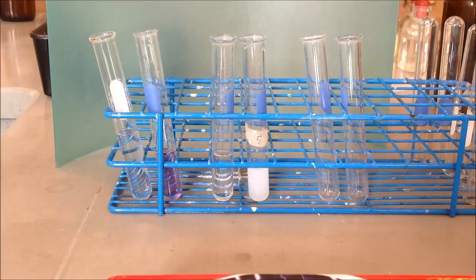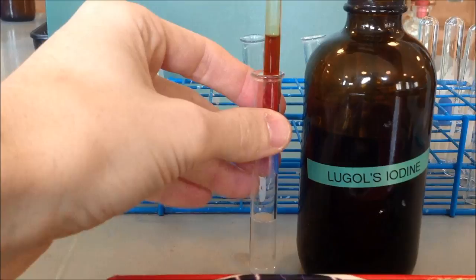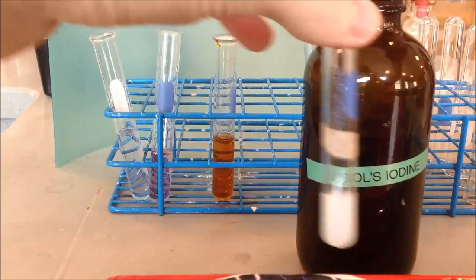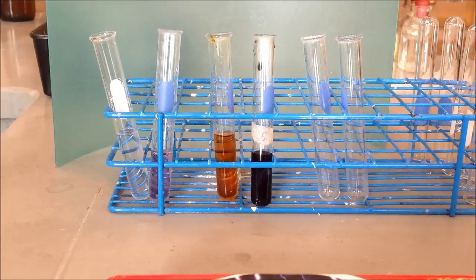To test for the presence of starch, we'll be using an indicator called Lugol's iodine solution. We'll put that in the water — the water has no starch in it, so we'll be looking at what a negative test for starch looks like with Lugol's. There is our negative — no starch present. Then we'll take our starch solution, which obviously has starch in it, and test it with Lugol's iodine. We have a positive and a negative for starch — a negative for starch with Lugol's iodine, and a positive for starch with Lugol's iodine.